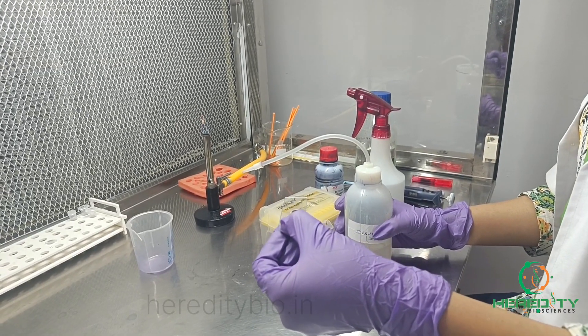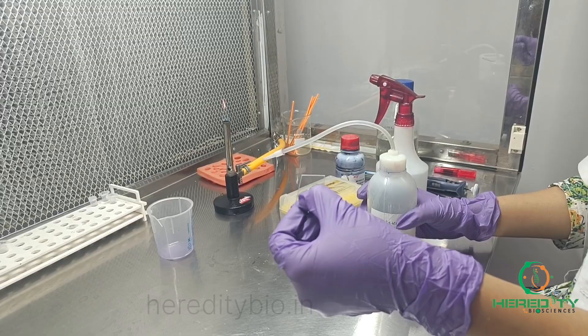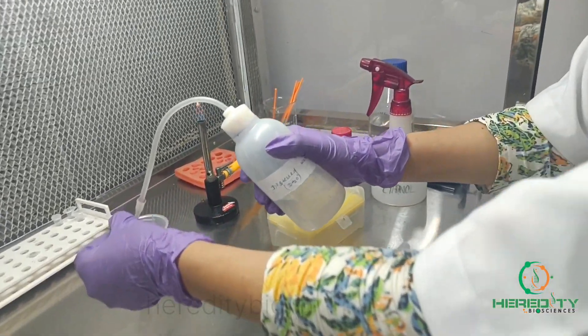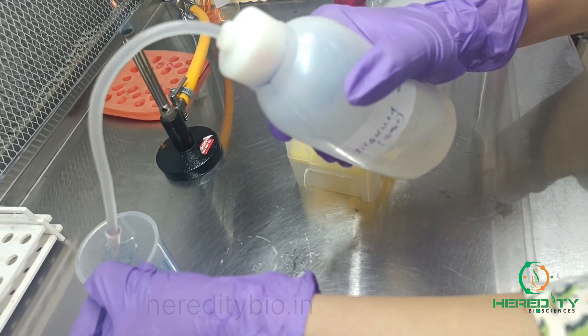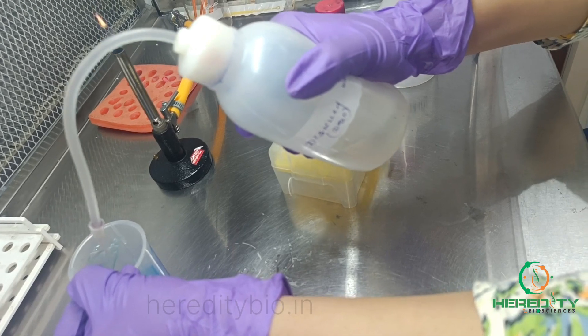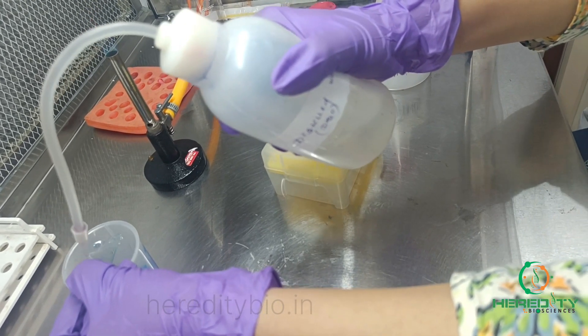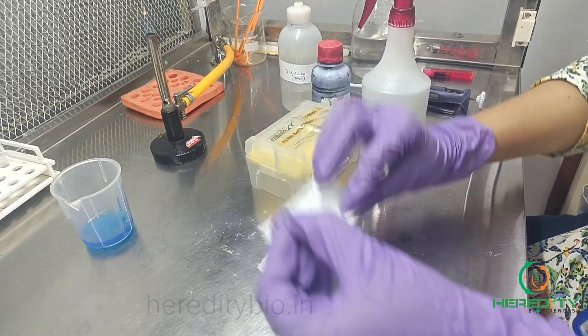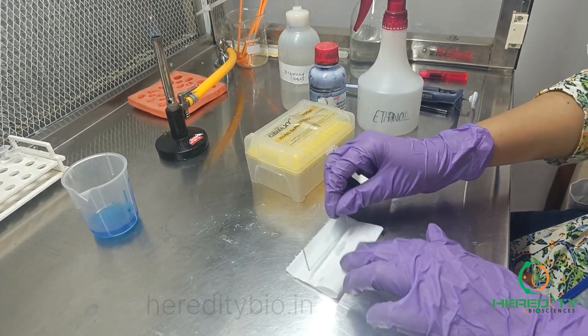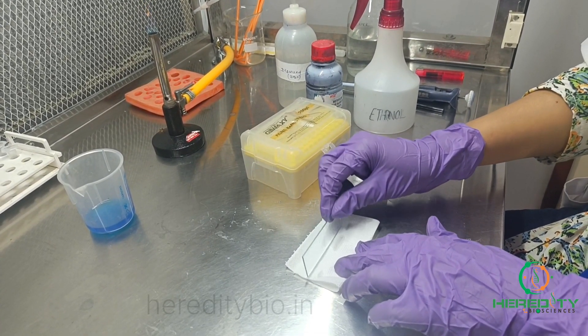After a minute, we will wash the methylene blue off with the help of distilled water gently. Then blot away the excess water from the glass slide with the help of filter paper or tissue paper.